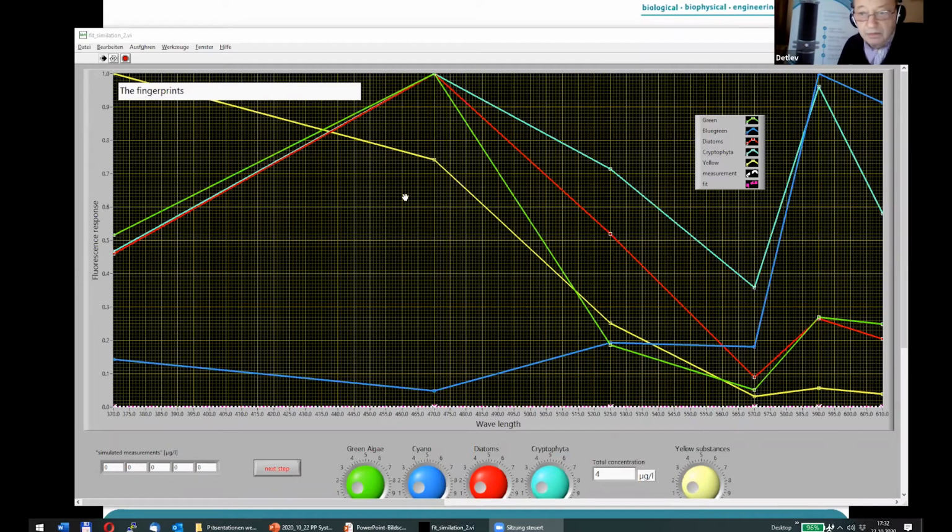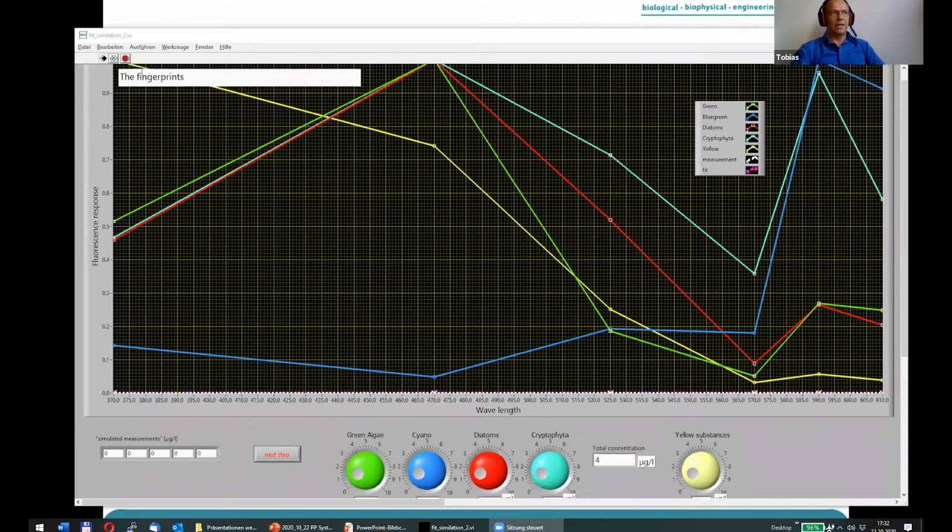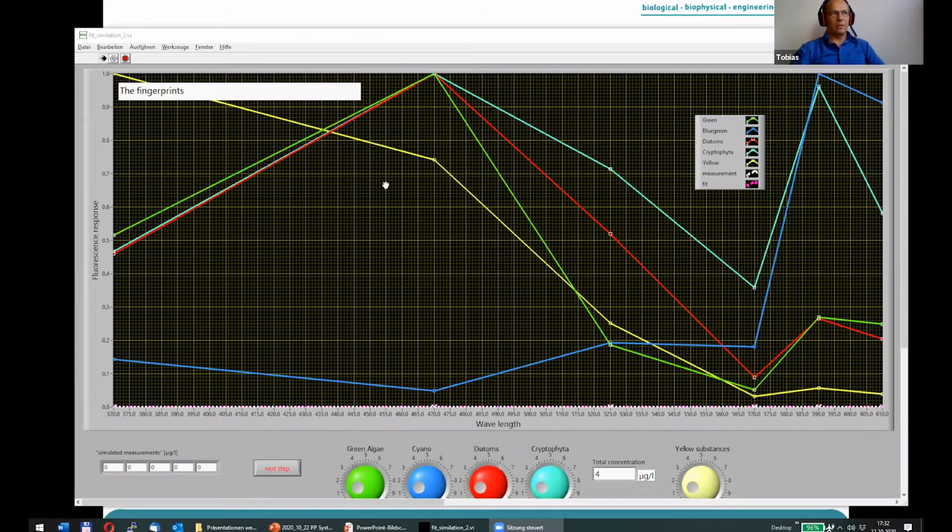And you see here that they are normalized for 1 microgram per liter, and that is calibrated in our laboratory, and we multiply this with a content to get the best fit out of that. We multiply all of them, getting bigger and lower again, to get the best fit, and out of that we have the content of the algae.